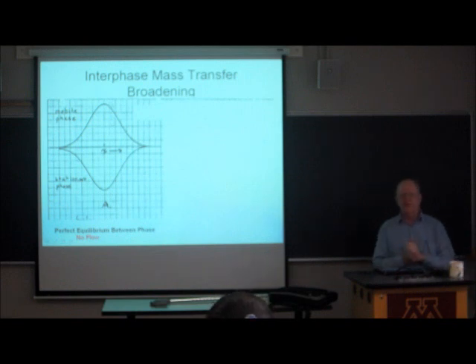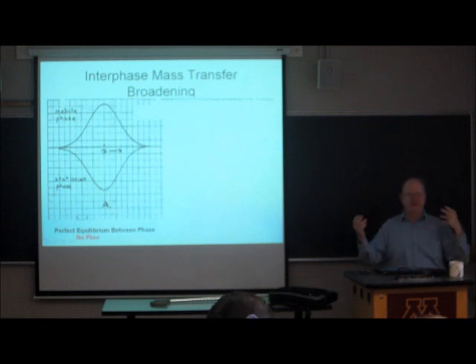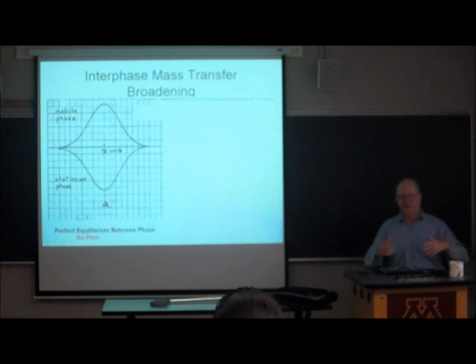Now, so far I haven't told you a darn thing about where A, B, and C come from, except they're somehow related to the particle size and the velocity and viscosity and diffusion and whatnot. But I haven't attached a physical meaning to A, B, or C.